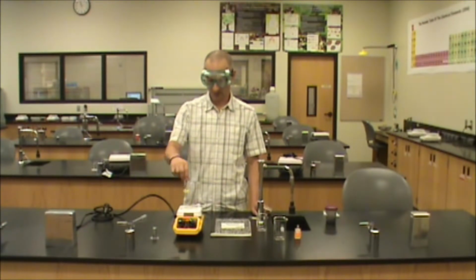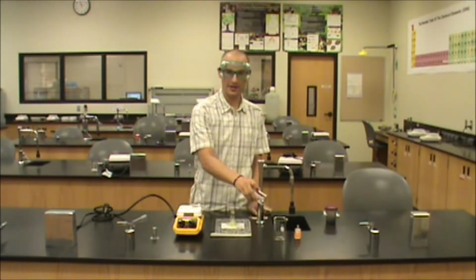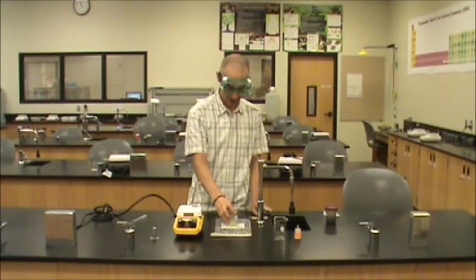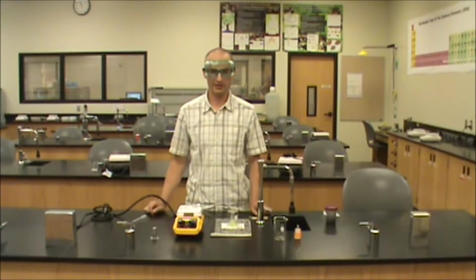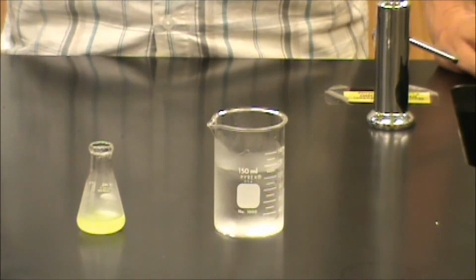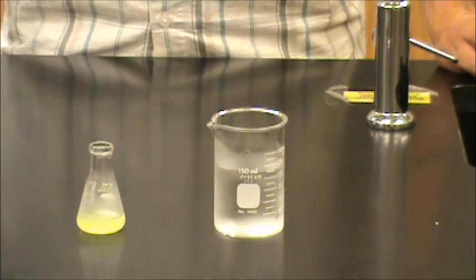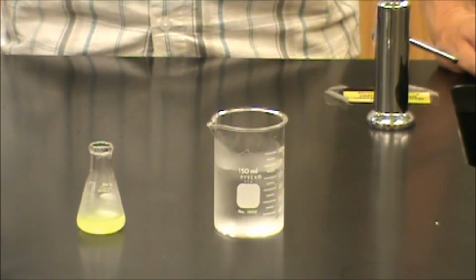I'm now going to remove it from the heat, set it on a lab notebook, and put an inverted beaker on top of it. We do this to slow the cooling process and maximize the crystal formation. After 5 to 10 minutes of cooling slowly, you'll notice that crystals have begun to form. You might see needles, plates, or a mix of the two.